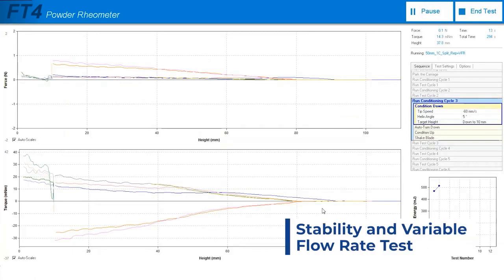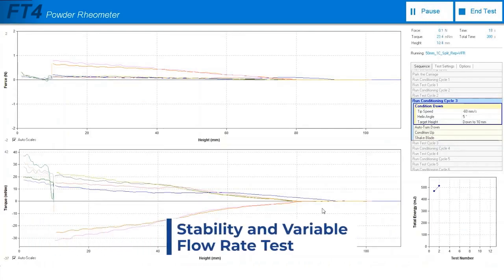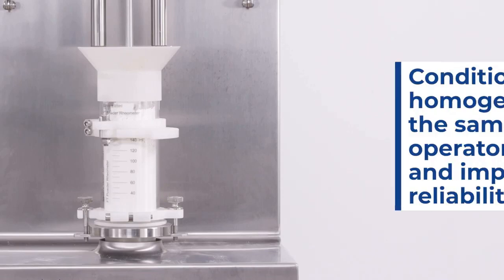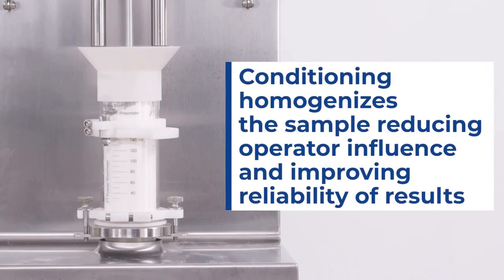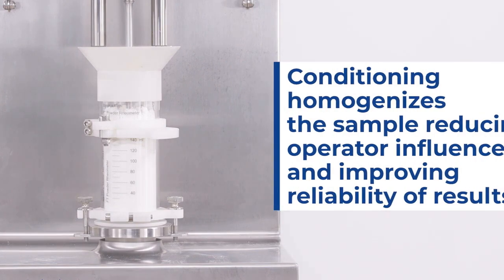In the stability and variable flow rate test, we are going to be running through multiple cycles of conditioning and testing the powder in order to characterize its flowability as it undergoes repeated test cycles in the FT4. This test sequence will begin with one conditioning step which is meant to homogenize the powder and give us a loosely packed, repeatable initial condition for the powder's packing.